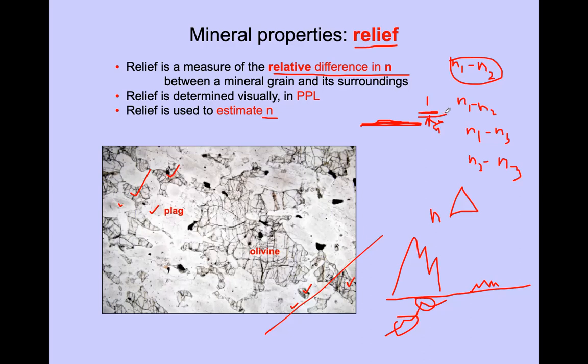This is a permanent glue, and then you have the mineral. So these two will give you this relative difference in refractive index, between this glue, because this is transparent glue, and the mineral. This is a special glue used for pasting minerals. You can't use any glue. There is a reason for that also. I will explain that later on. That glue is laid on top of the glass, and on that you have the mineral.